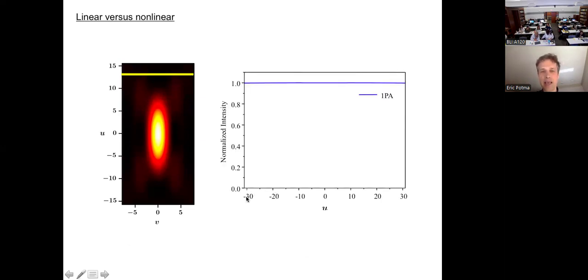Okay, so this is basically the depth. I'm scanning the layer through this according to this axial scan. This is the axial axis. And you see, there is no difference. Okay? How can that be? I can clearly see there's more intensity here than there. And that's because if you integrate over the entire plane, it's the same, because the number of photons that come in any plane is the same. Okay? I send 100 photons in, they come through a plane, and then they focus, still 100 photons. And then they diverge once again, but still 100 photons. So if I have a fluorescent layer that is uniformly fluorescent, the signal doesn't change.